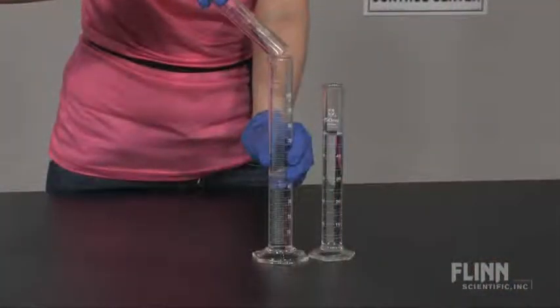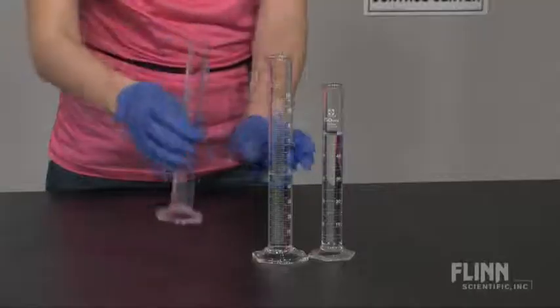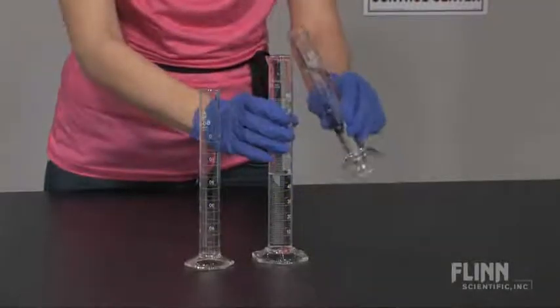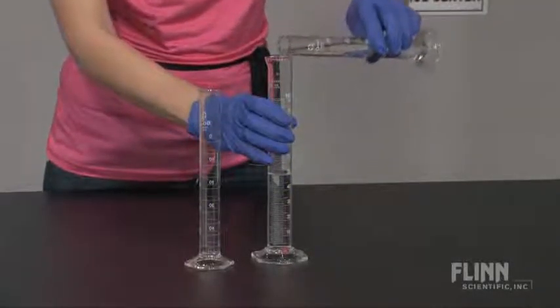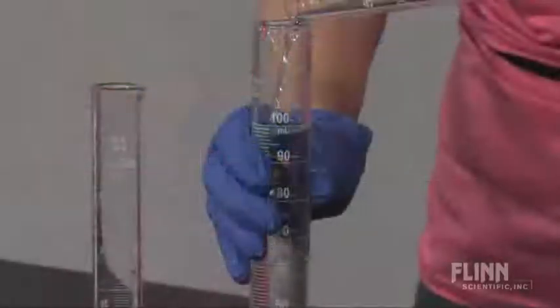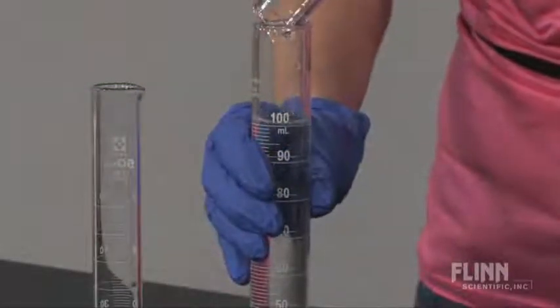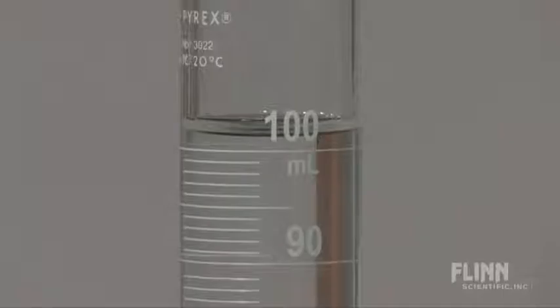When you combine 50 milliliters of hydrochloric acid and 50 milliliters of sodium hydroxide, a volume greater than 100 milliliters is produced. This is due to the different densities of the reactants and products.